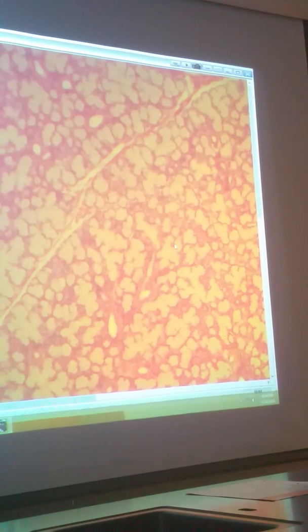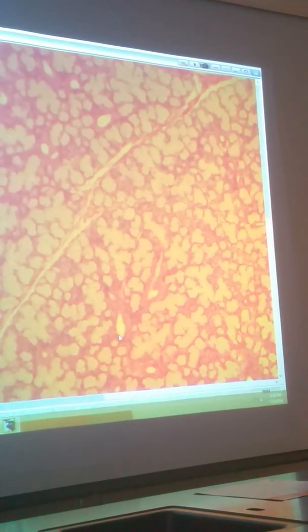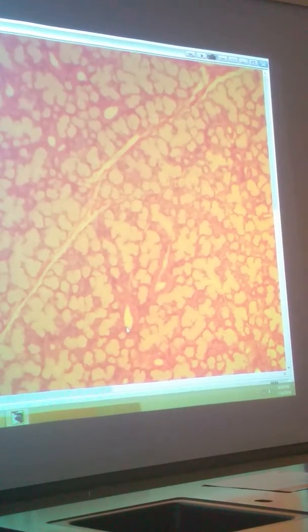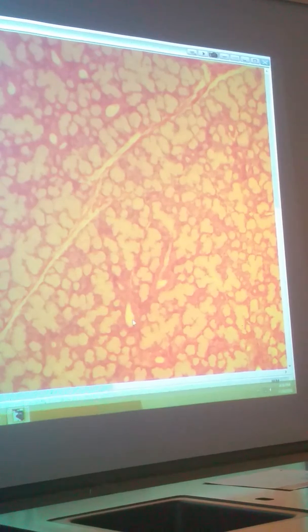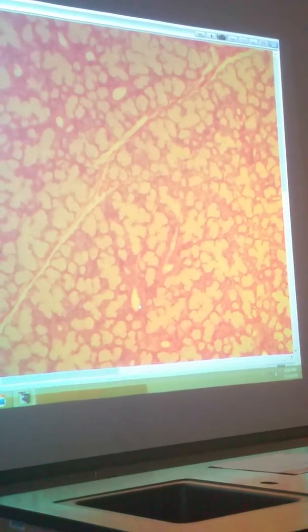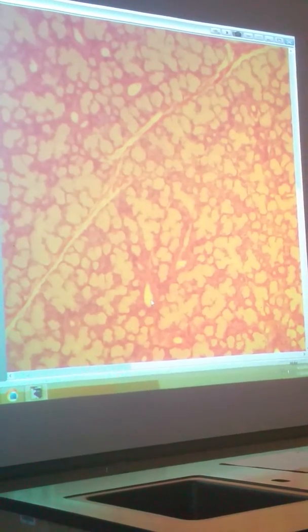Okay, let's see if we see it. This is one duct here. It looks a little darker. This is sublingual. Now, why is it sublingual? Because the sublingual consists mostly of mucus acinus. That's a duct right there.